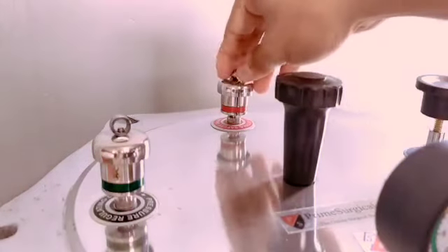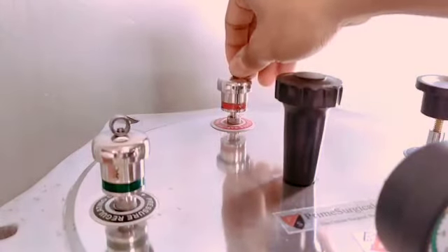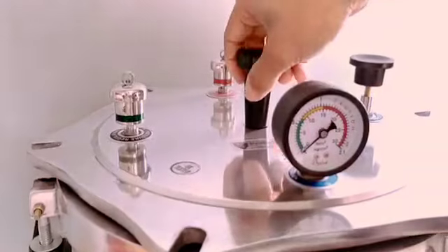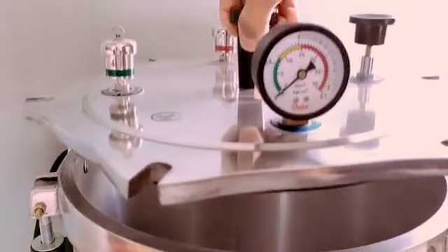Double safety valve or safety valve 2 with a red color code. This whistle valve is kind of a fail-safe device that springs into action if the main safety valve 1 fails to let out steam at 15 psi and the pressure gauge reaches all the way up to 20 psi or so. At 18 to 20 psi, the double safety valve is supposed to whistle and blow out excess steam to re-stabilize internal pressure. Lid handle to aid in the opening and closing of the autoclave lid.